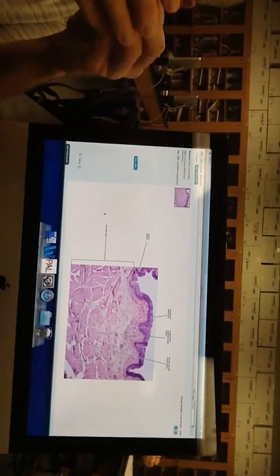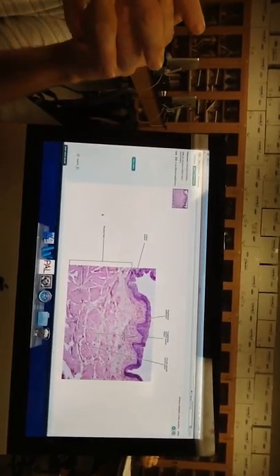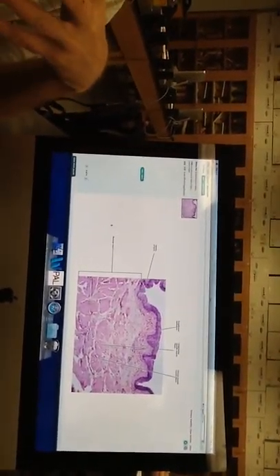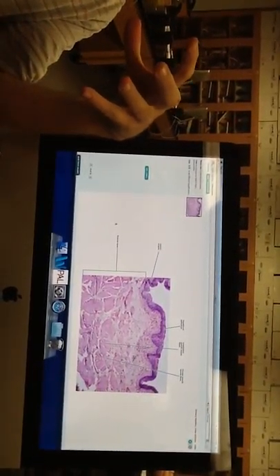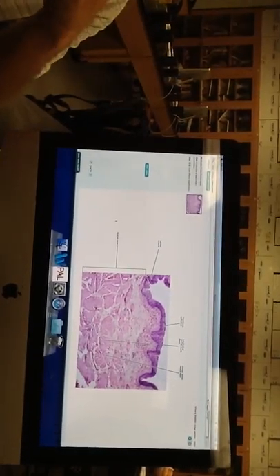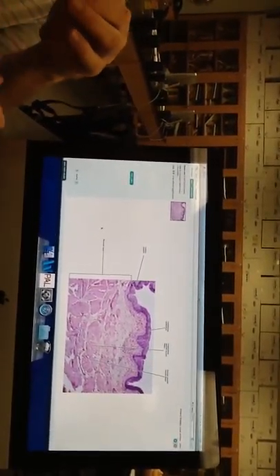More ducts cutting, cut cross-section. I'm, again, not expecting to tell the difference. Now we're on to the bladder. And the bladder, the distinctive feature is that transitional epithelium.